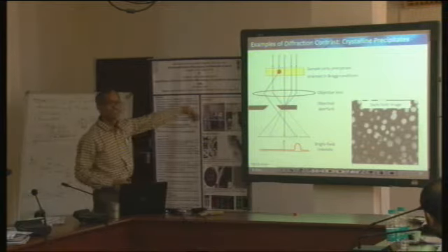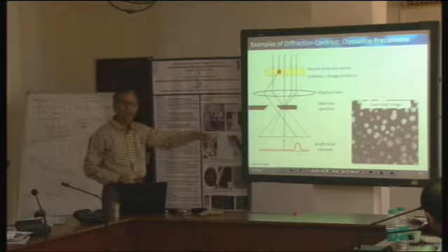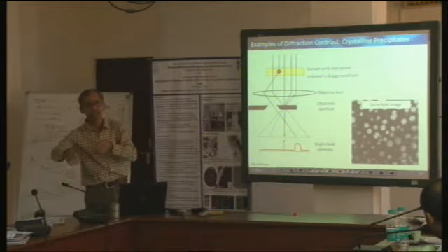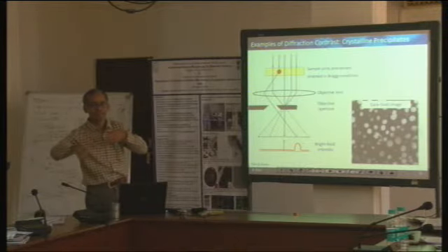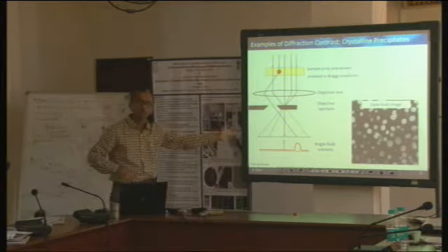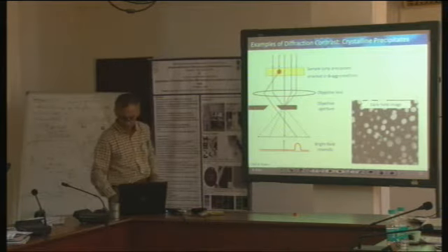And here, of course, it's just a complementary thing. Earlier it was a bright field image, now it is a dark field image. A dark field image we make with the diffracted beam. There, all these precipitates are getting scattered in the diffracted beam, and therefore they all look bright in the dark field. This is, I think, clear. The schematic of that is shown here.